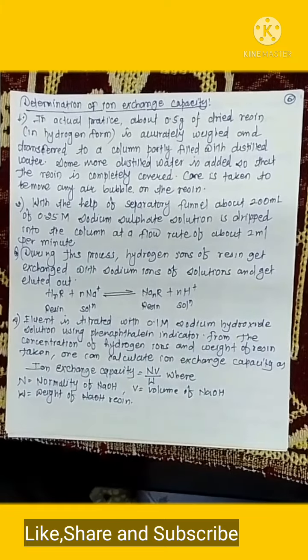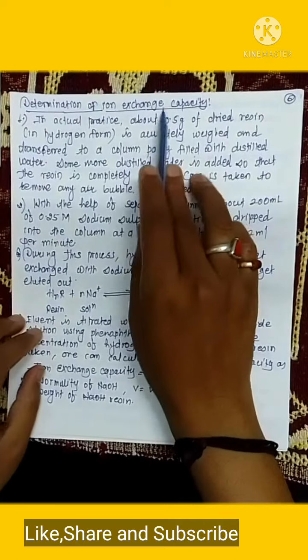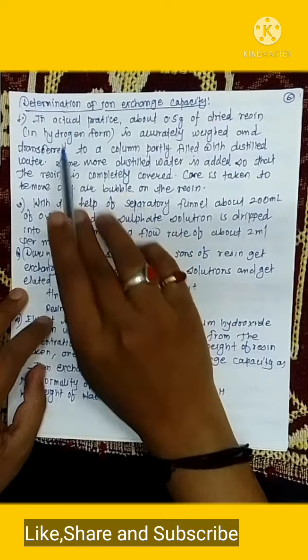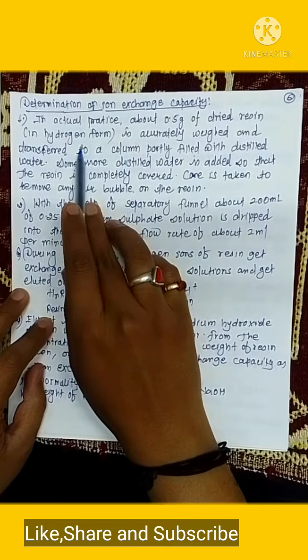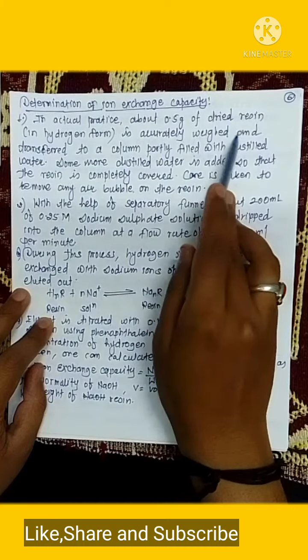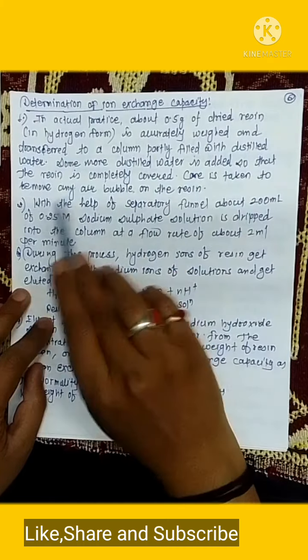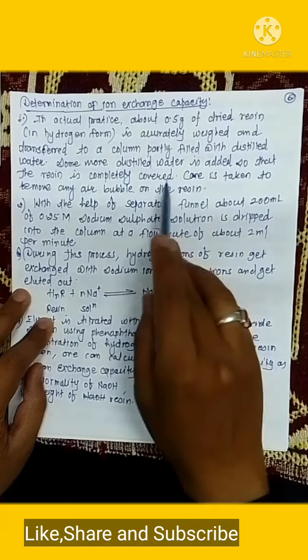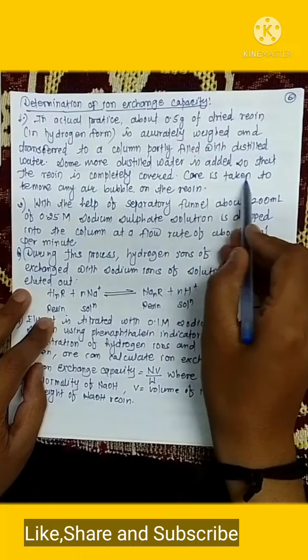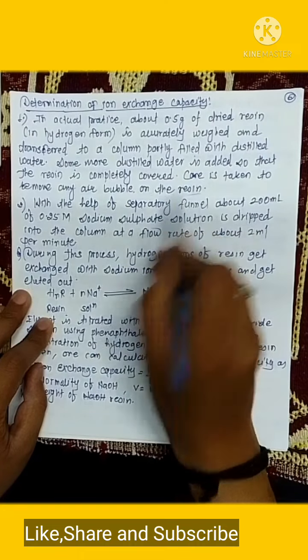Good morning, student. Today we are going to see determination of ion exchange capacity. In actual practice, about 0.5 gram of dried resin in hydrogen form is accurately weighed and transferred to the column partly filled with distilled water. Some more distilled water is added so that the resin is completely covered. Care is taken to remove any air bubbles on the resin.